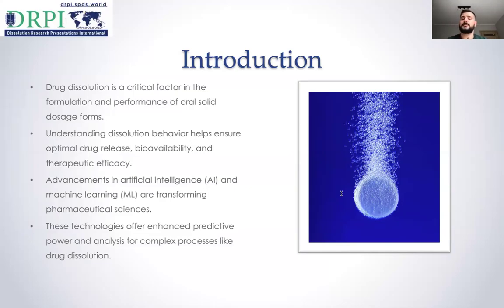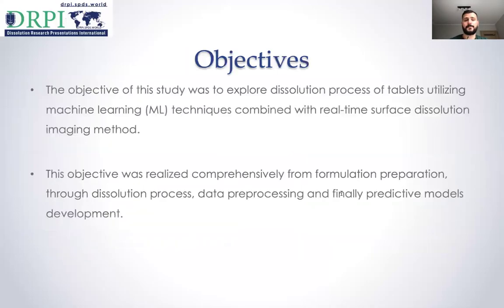These technologies enable deeper analysis and understanding of complex processes, including drug dissolution. So this study leverages these tools to enhance the understanding and prediction of drug release behavior.